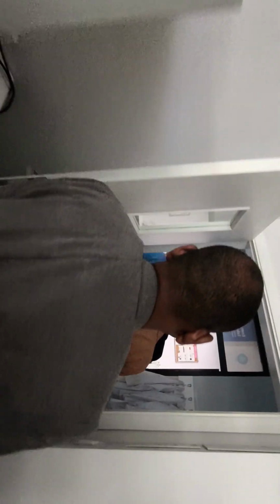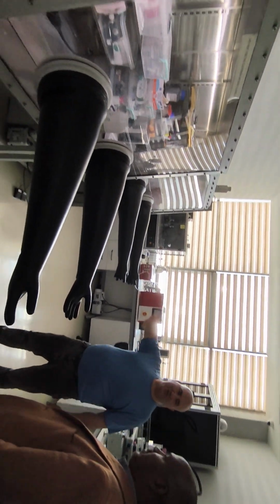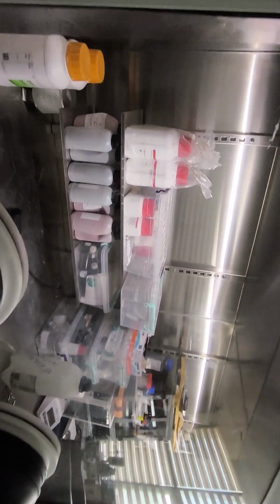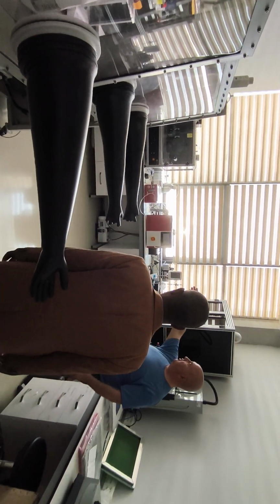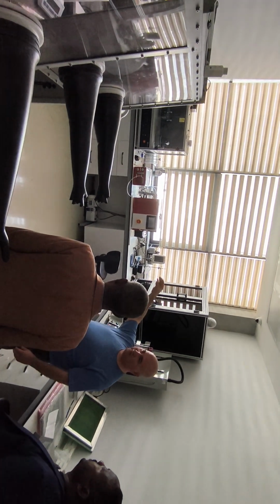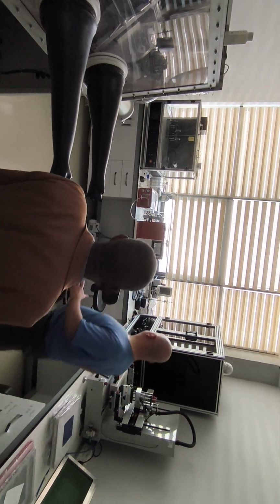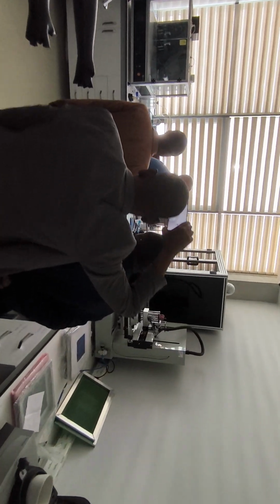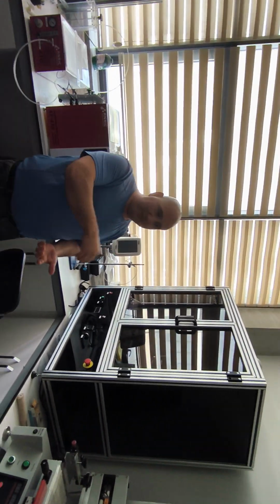Now, this one is also for production. This is our glovebox. If we need to work under argon without oxygen, in a clean area, without humidity, no moisture inside. And we can make, for example, thin film production, atomic layer deposition, or electrofiber, and ultrasonic. This one is for viscosity.